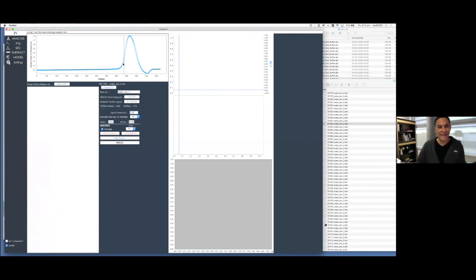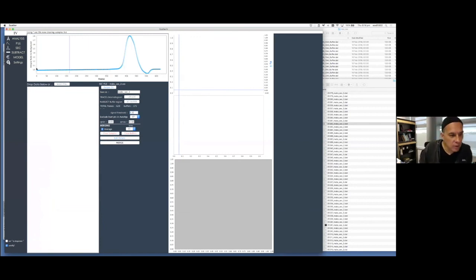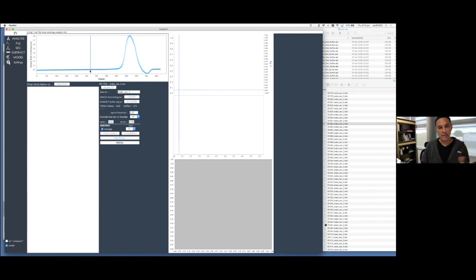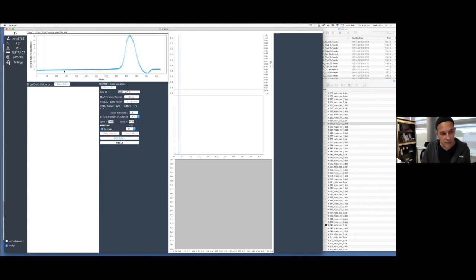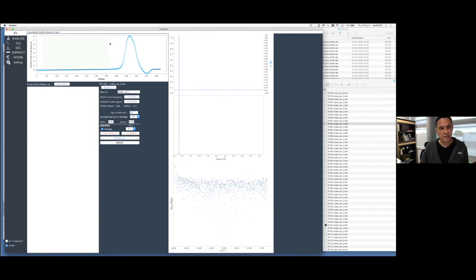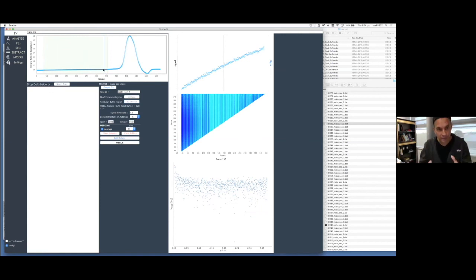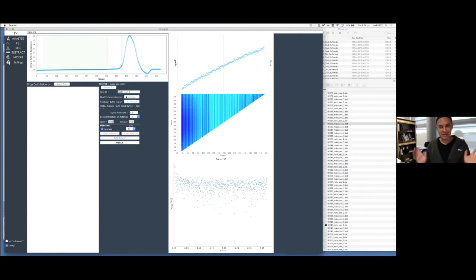The signal threshold of 1.1 means anything above 1.1 will have an Rg calculated. The points in gray are what Scatter guessed should be the buffer. If you like that, keep it; if not, you can reset it by highlighting that whole region and hitting Set Buffer, then Update. Update will reprocess the whole thing, redo the subtraction, and then you're done.